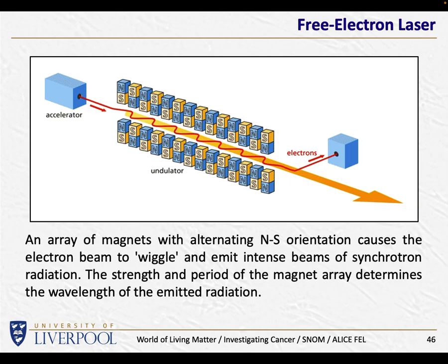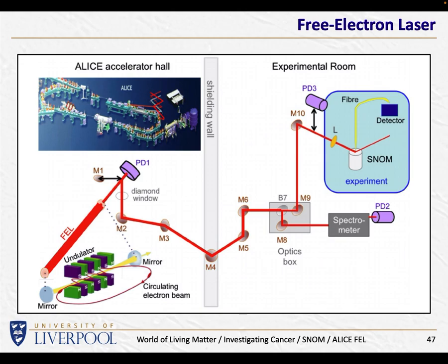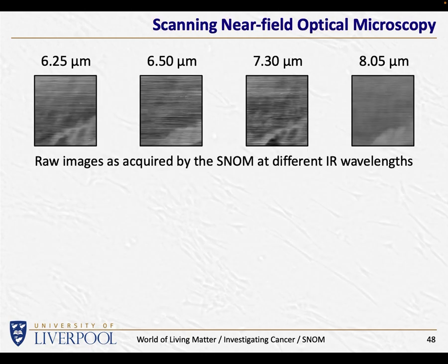A few years back when we started this idea, back in the early teenies, we said, can we basically dial in various different wavelengths and see how human tissue biopsies, not taken by us, but taken by medics a few years ago, actually absorb infrared light of specific wavelengths? So light from the electron accelerator was bounced off 1,000 mirrors by the looks of it until it arrived at a microscope where we obtained pretty horrible quality images. This is early on, and we looked at this, thought this is going to be tough. We can just about see something, but these are low resolution and very noisy images.